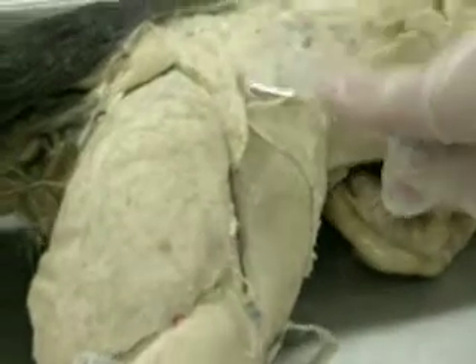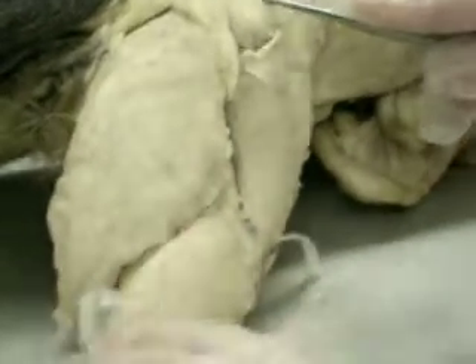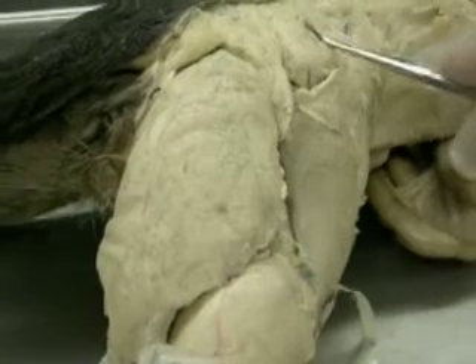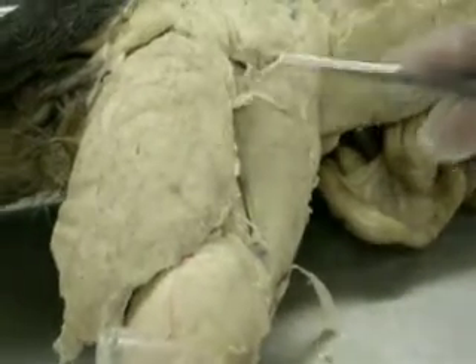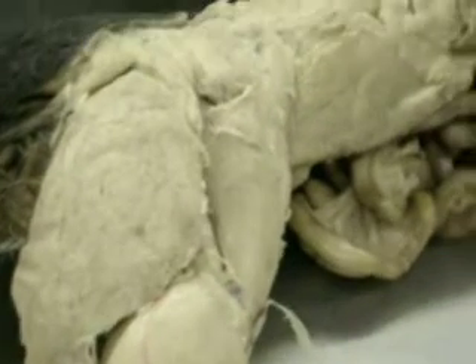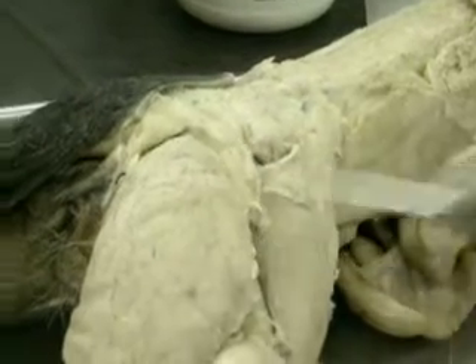In the cat, you can see three muscles. The first one is the gluteus medius, then the one in the middle is the gluteus maximus, and then the strip here is the caudofemoralis — you only have that in the cat. So it goes: gluteus medius, gluteus maximus, caudofemoralis.